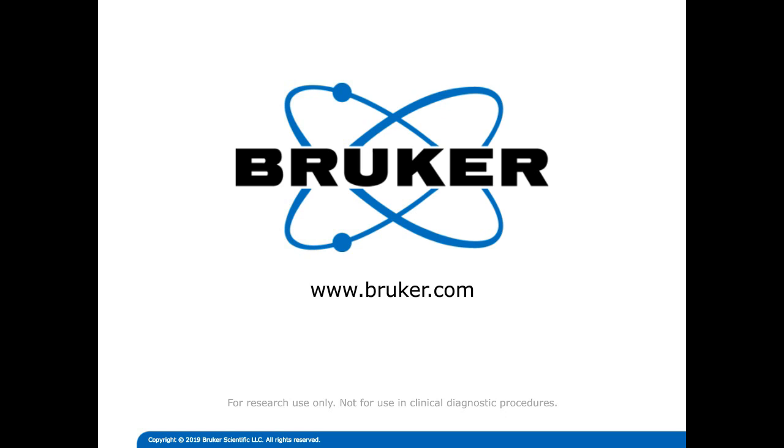Another question asks, can MS data acquired from other softwares be analyzed with BioPharma software? So I'm not sure about this one. I'll probably have to get back to you on that. So this is specifically for the oligos. I'll have to look into it. I know that for the proteins and other workflows, it is possible to look at data acquired from other instruments. So my guess would be that it should be possible for the oligonucleotides as well, but I would have to get back to you offline on that one.